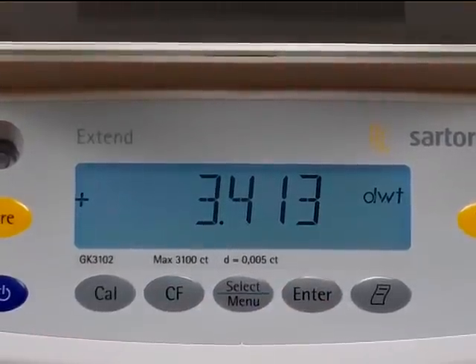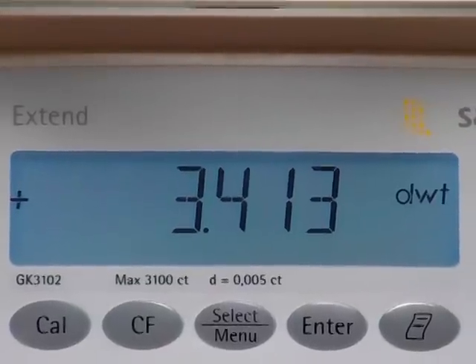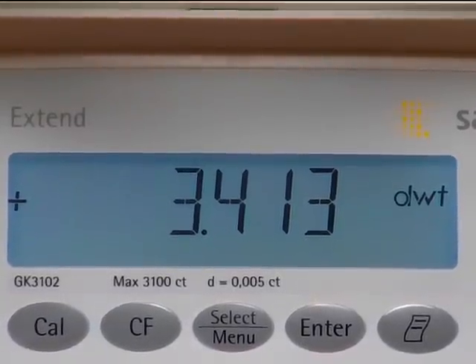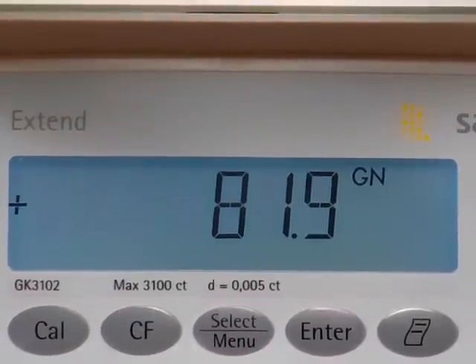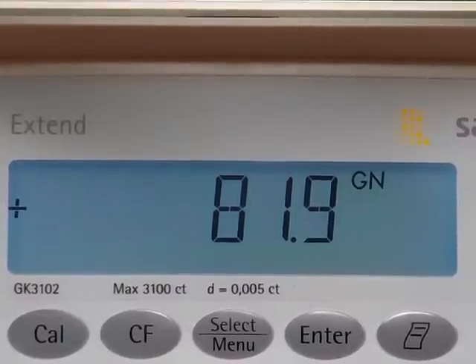Another press of the enter key and we're in pennyweight. Many jewelers buy this balance to weigh their scrap gold and silver — this balance weighs in pennyweight, and we have 3.413 pennyweight. Gun and ammo enthusiasts would want to weigh in grains — we have here 81.9 grains.